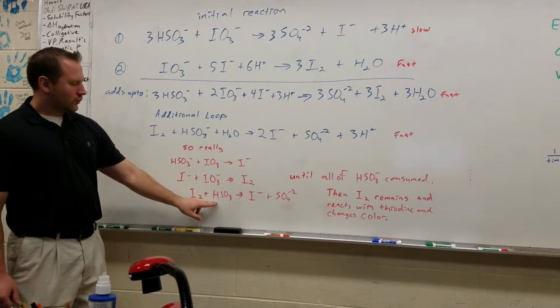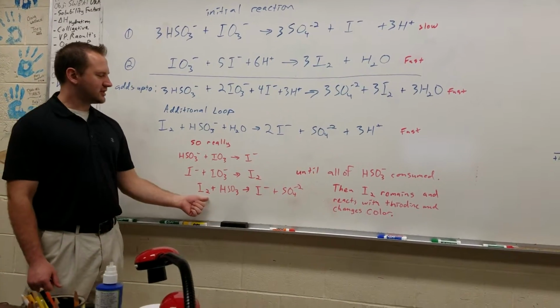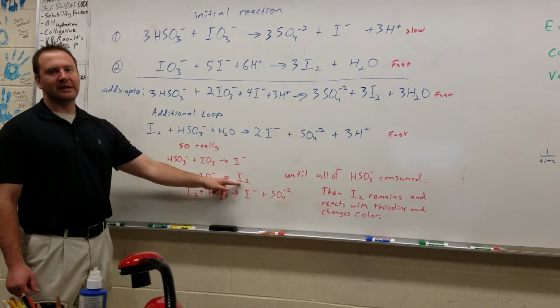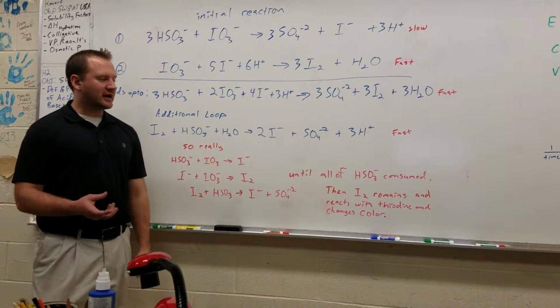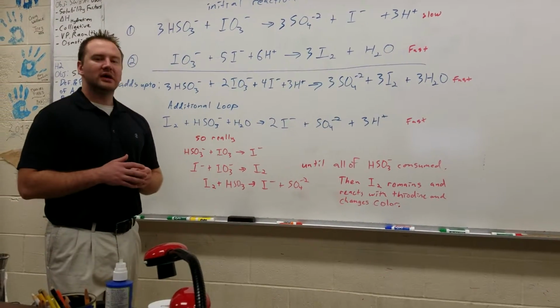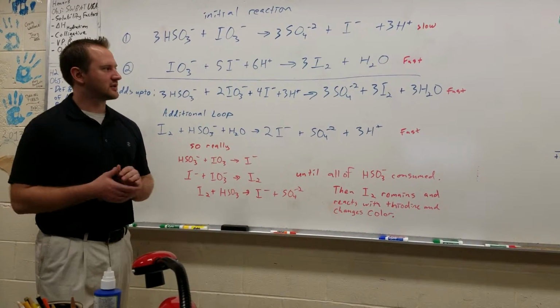However, once all of the bisulfite is consumed, you no longer have the possibility of this step occurring. And you end up with iodine left over in solution. And iodine, when that's in the presence of starch, is going to produce a nice dark complex.